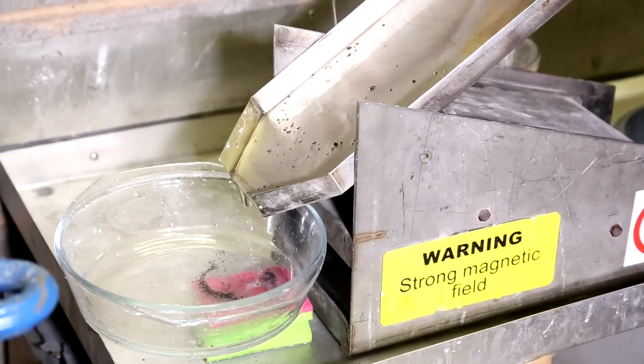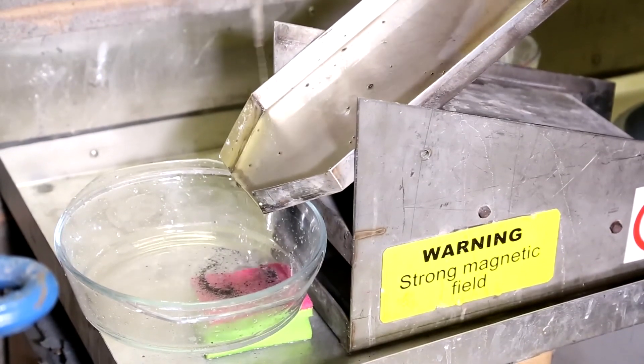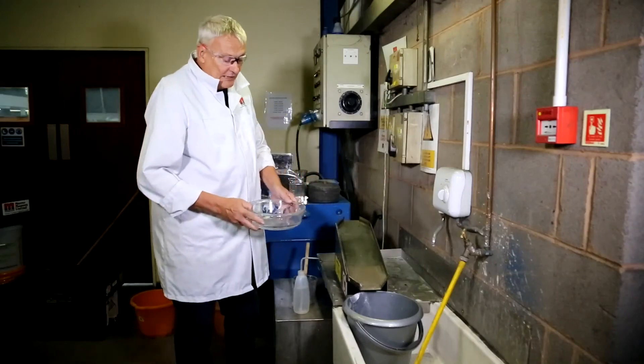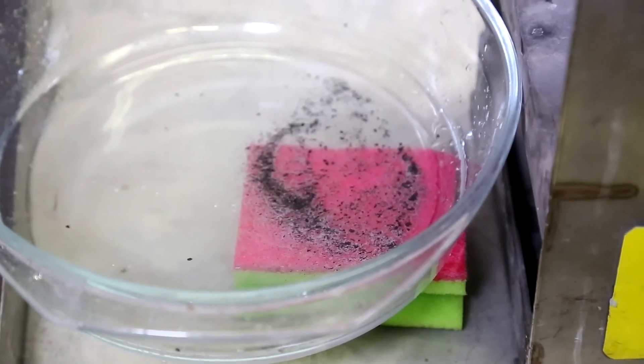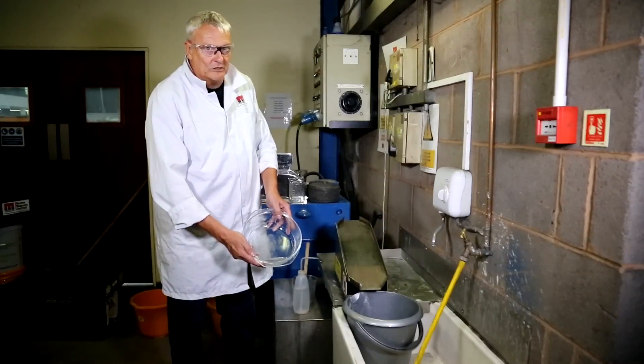These are used a lot in universities in conjunction with a high intensity wet separator. They're also used quite a lot at water treatment sites to check whether there is any metal contamination in water, and a number of those have been sold recently for those sorts of applications. Very useful — I use it all the time.